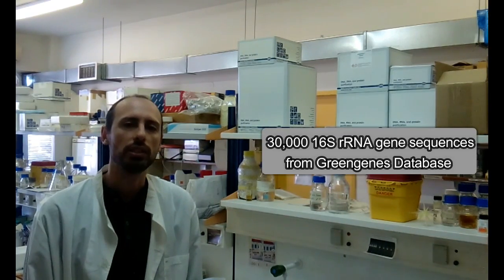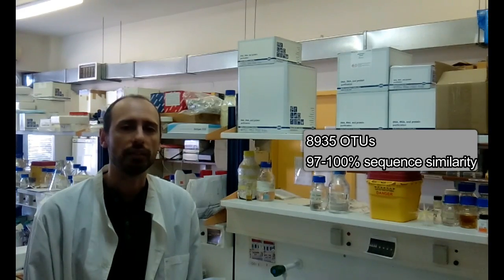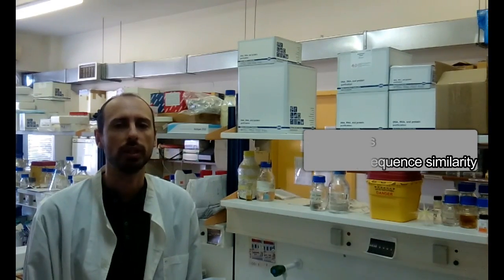The PhyloChip was developed at the Lawrence Berkeley National Lab, and its design was based on 30,000 16S rRNA gene sequences from the Greengenes database. These sequences were aligned and grouped into 9,000 clusters or OTUs with 97 to 100% sequence similarity. The clusters represent 842 subfamilies that belong to 121 prokaryotic orders. Chimeric sequences were also identified and removed from the dataset.